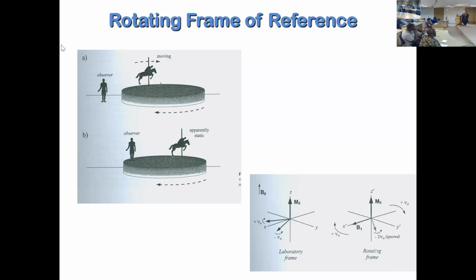Because the detector is in a rotating frame of reference. Suppose these protons are in different trains with very different speeds. There are several trains together, but with a very minor difference. So the detector also has to move very fast. The detector has to move with the same speed to observe the difference.